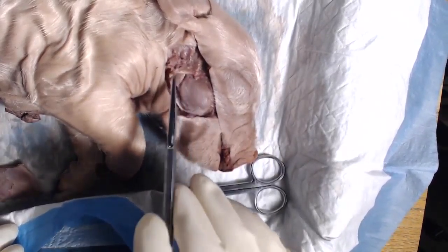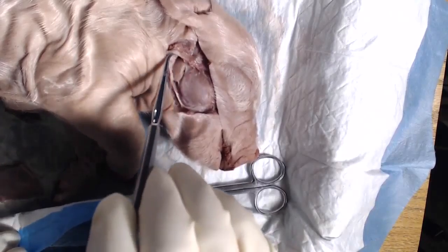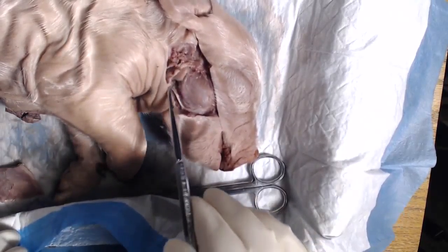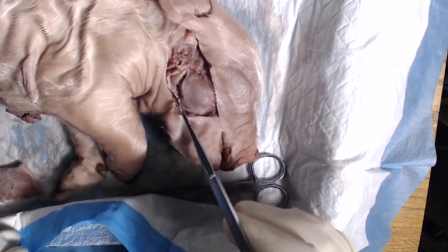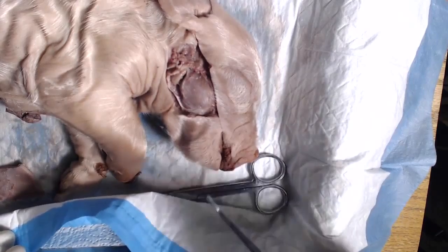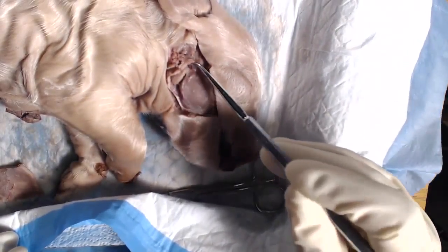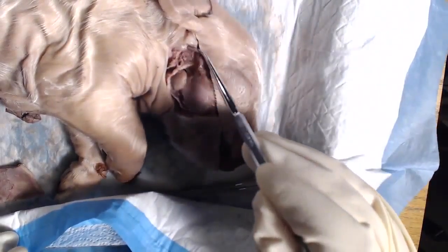And then to get to our submandibular gland, you just want to pull your parotid back towards the ear, the pig's ear, and you should see that submandibular gland pretty much right under that parotid, but still behind the masseter. So again, I have masseter, submandibular gland here, and then parotid.